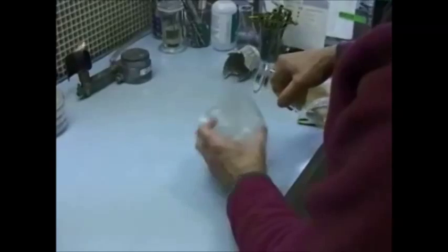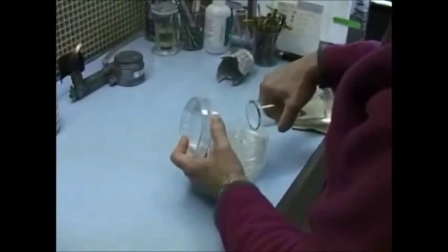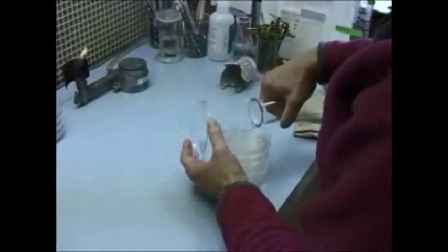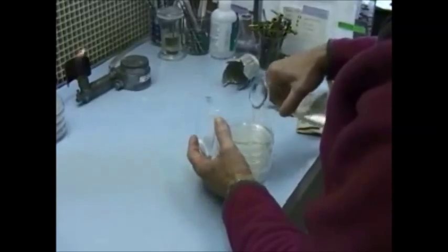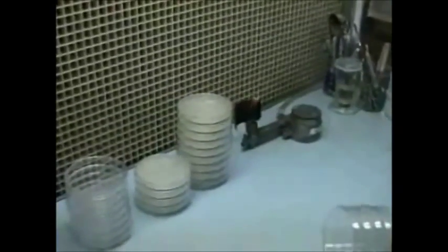We're ending up with about 15 mLs of agar in each plate. Once the plates have cooled off further, the agar is going to solidify, and you're going to have a nice, clean, clear plate of agar to use for your pure culture work.